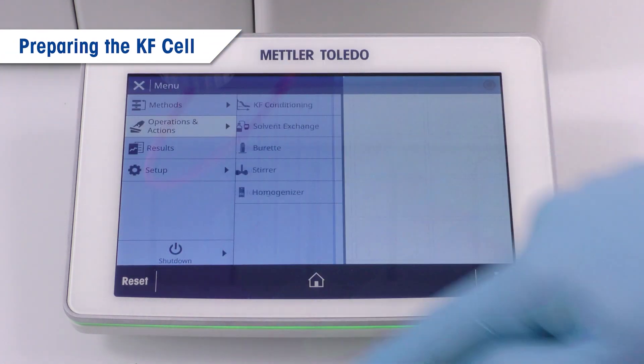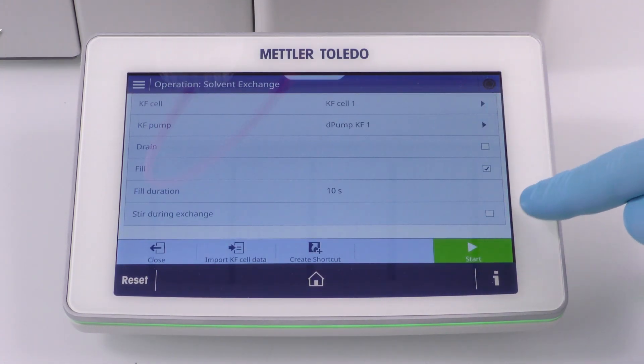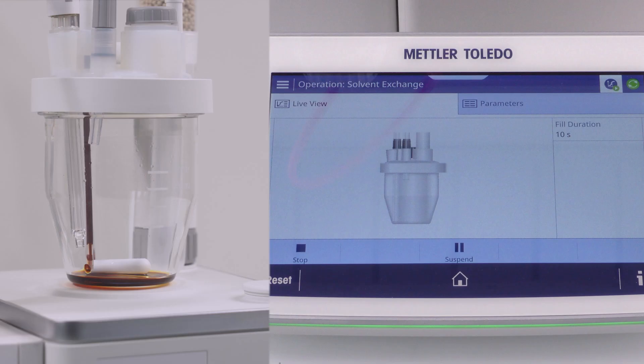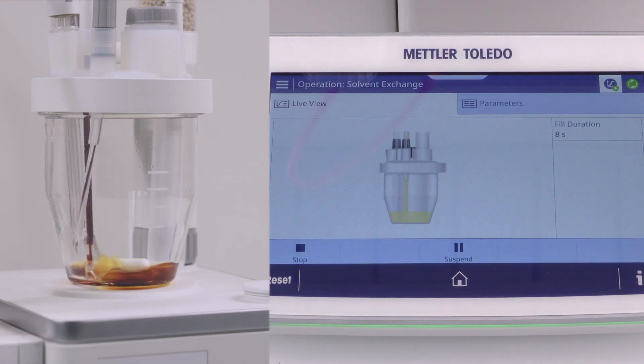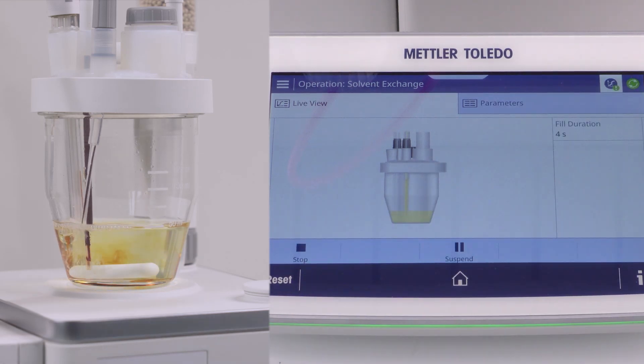Let's now fill the KF cell using the operation solvent exchange. Stop the filling process manually as soon as the solvent level reaches the pins of the polarized sensor.